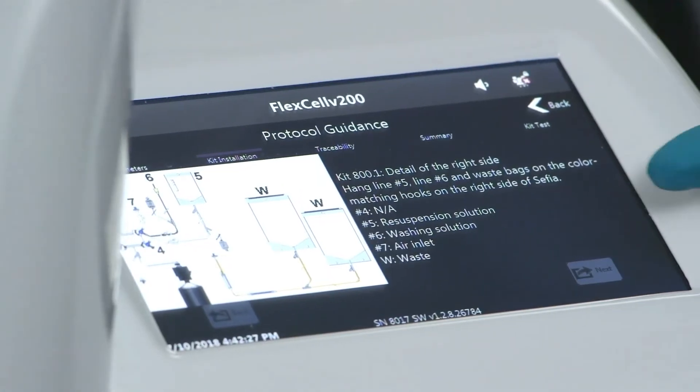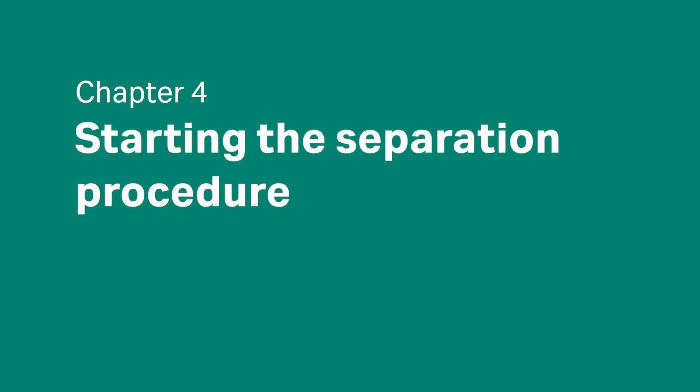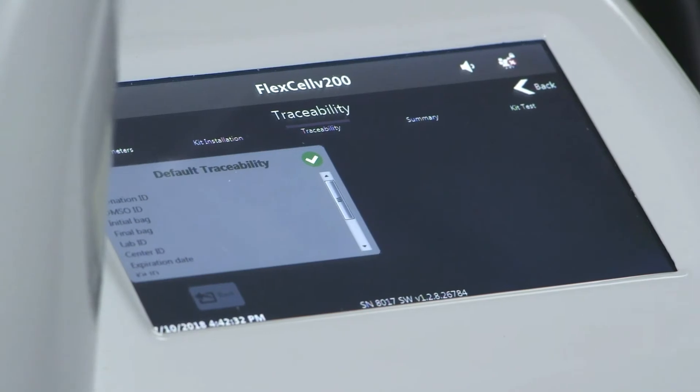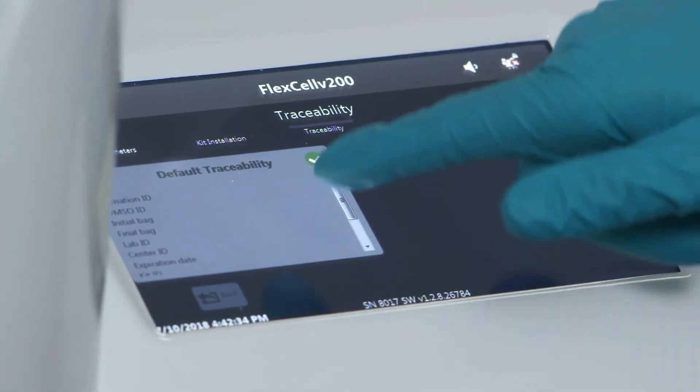Then select Next on the instrument screen. Once kit installation is completed, review the traceability configuration.